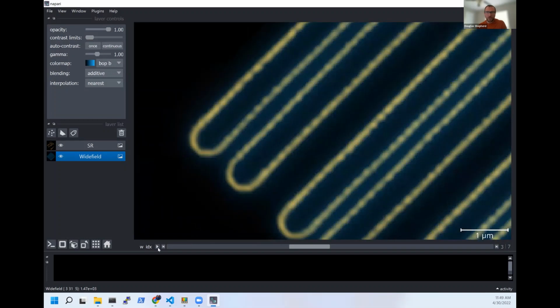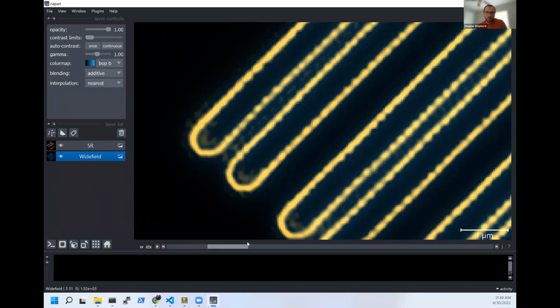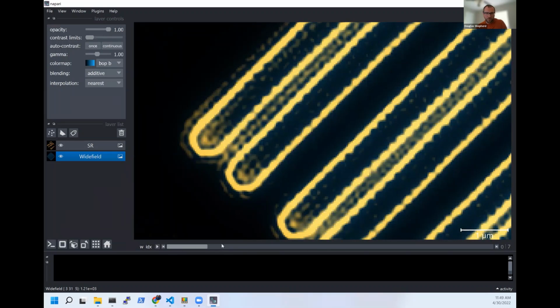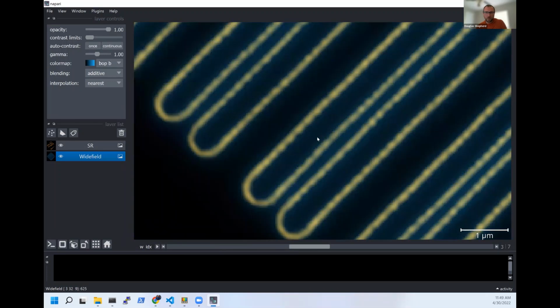And then here you can actually see one of these classic artifacts, the hammer stroke artifact that Peter referred to. So as I bring the Wiener parameter up off the floor, you can see right around here in the middle, which would correspond to, let's see, 0.05, 0.1, 0.15, 0.2. Now we've suppressed the high frequency ringing artifacts, but we've still retained a fair amount of the super resolution information.